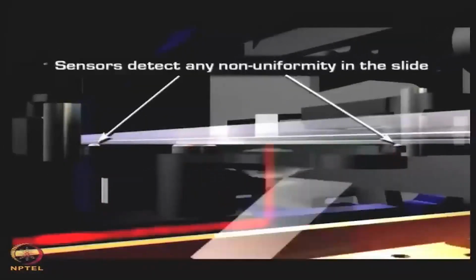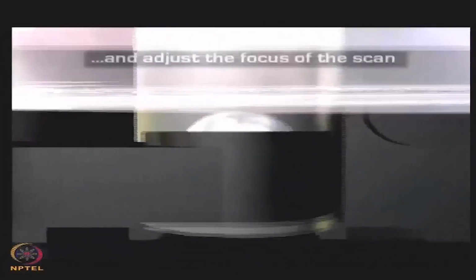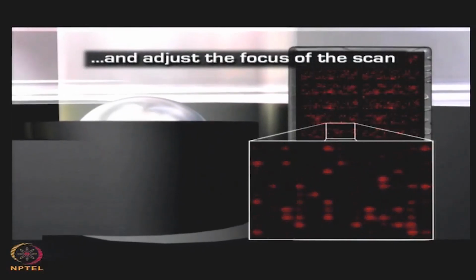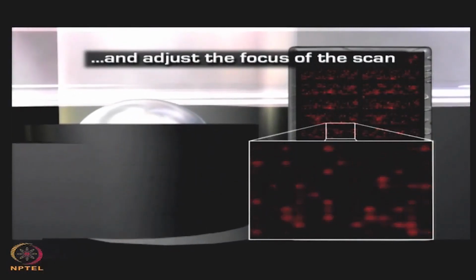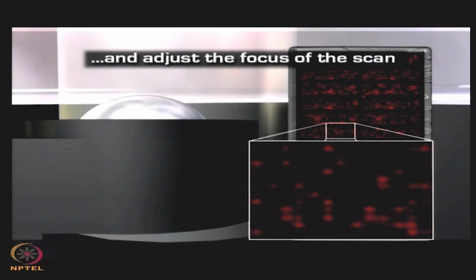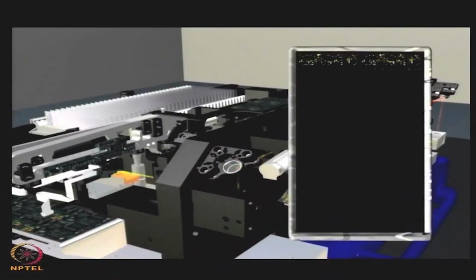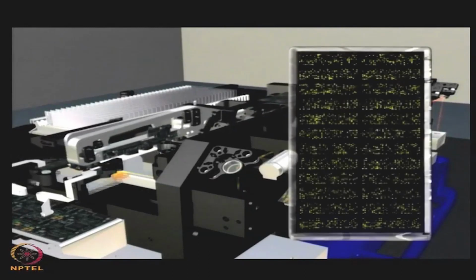As the scan proceeds, sensors detect any non-uniformity in the slide surface, and the robotic arm adjusts the slide position accordingly to ensure the array surface is always in perfect focus. Each channel is scanned sequentially, and the developing images are displayed on the monitor.